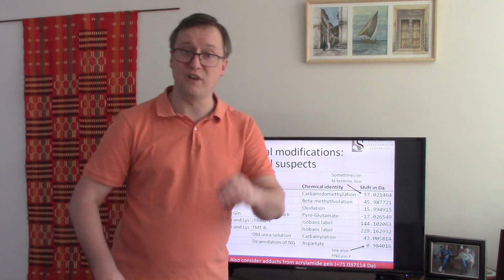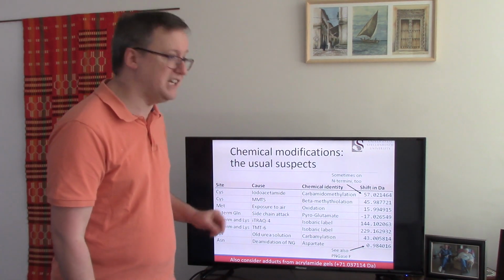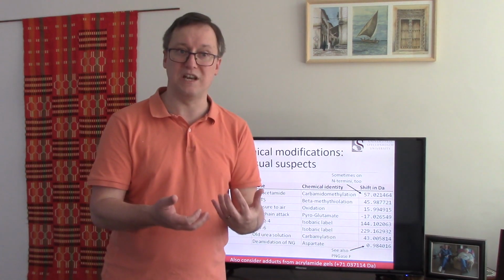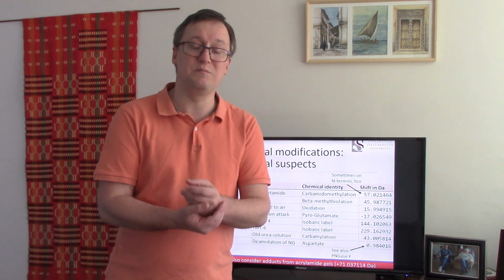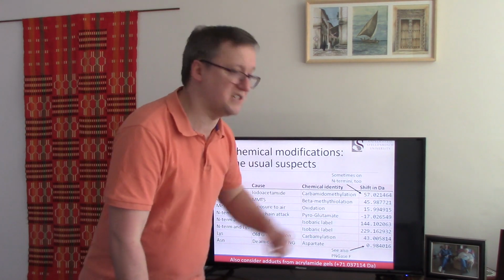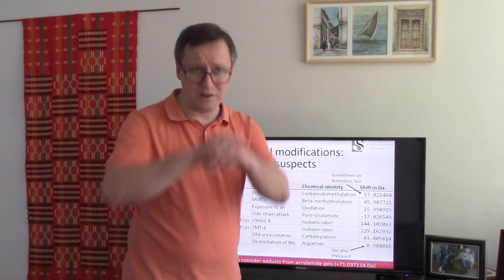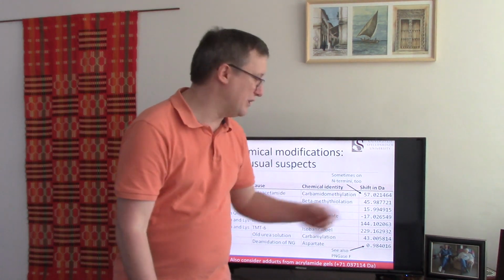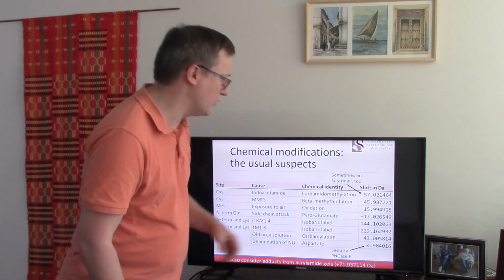All right, next up, methionine. Cysteine, methionine, and tryptophan are the three least common amino acids, and yet we see that methionine is tricky in its own right, because in handling your sample, you might leave it on the bench a little while and find that methionine has become oxidized. So oxidized methionine changes its mass by 16 mass units. And if you remember your table of atomic masses, you're going to remember that on the periodic table, oxygen shows up at 16 Daltons. Okay, great.